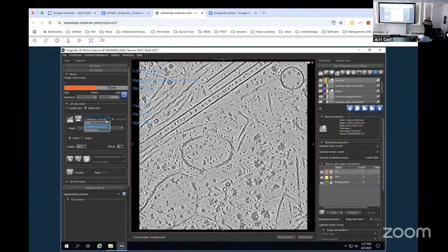All right. So in the drop-down menu, there's 3 different tools. There's the full brush, the adaptive Gaussian, and the local Otsu. Full is fairly self-explanatory. It's just like you drag that tool and it paints in everything that it covers. And you can do that. In fact, I'll just show you real quick. You can see that you have this brush now.